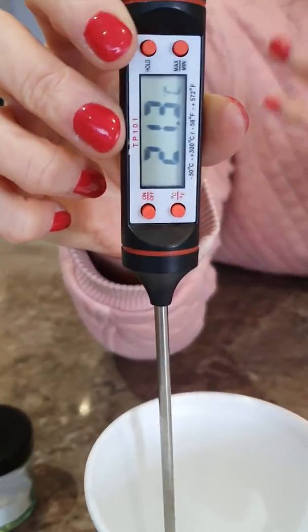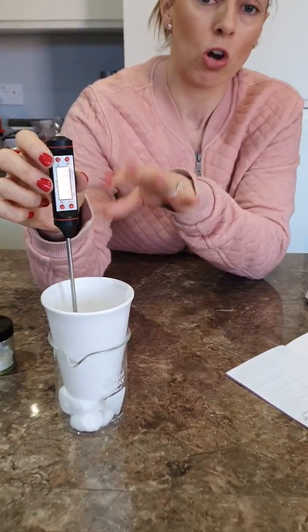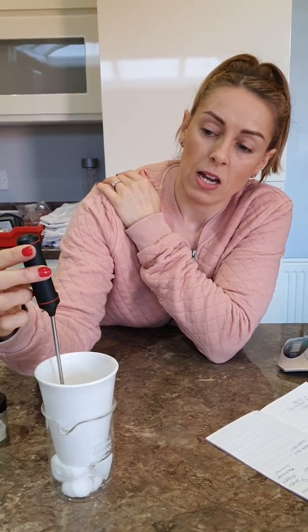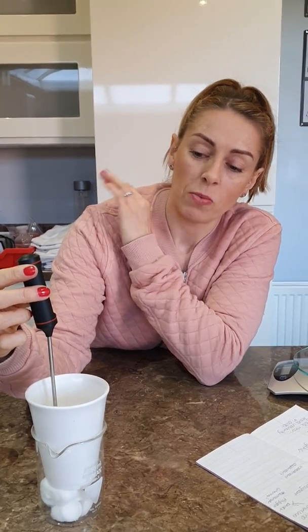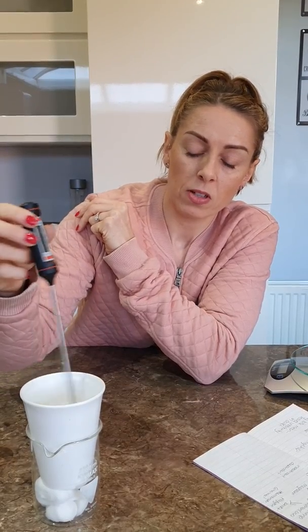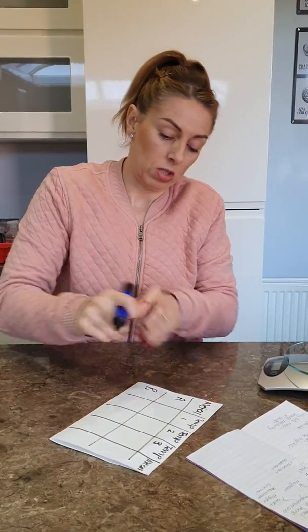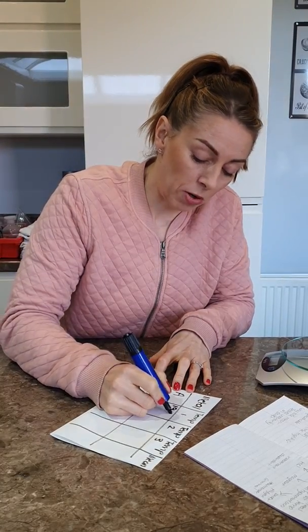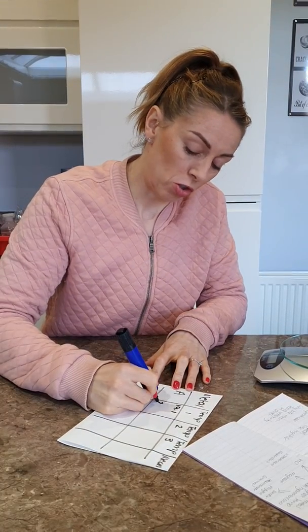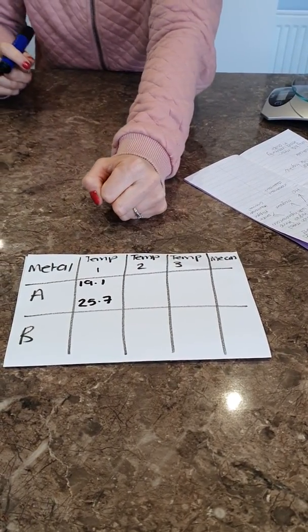We're looking for the highest temperature change on the thermometer, so I wait until the temperature stops rising. I'll record in my table that the temperature started at 19.1 degrees and rose to 25.7 degrees.